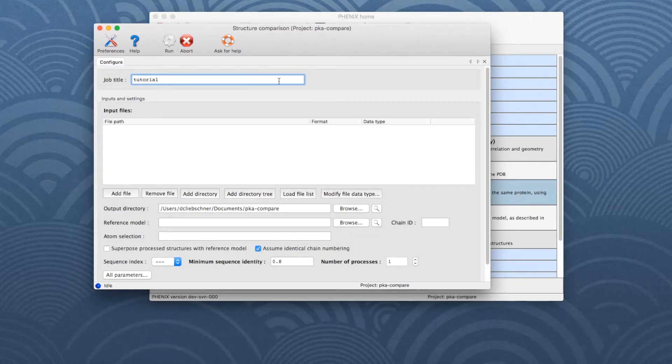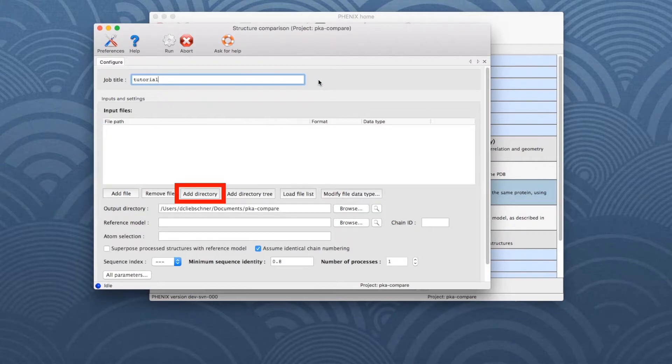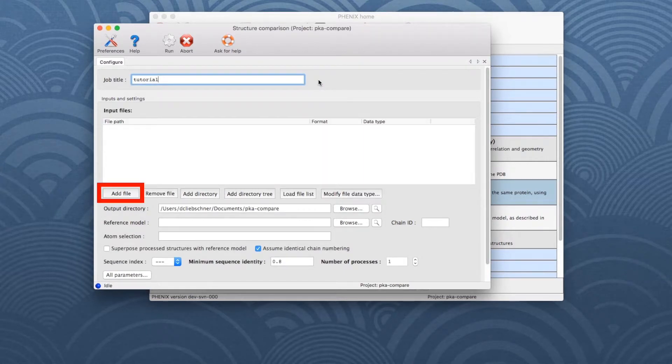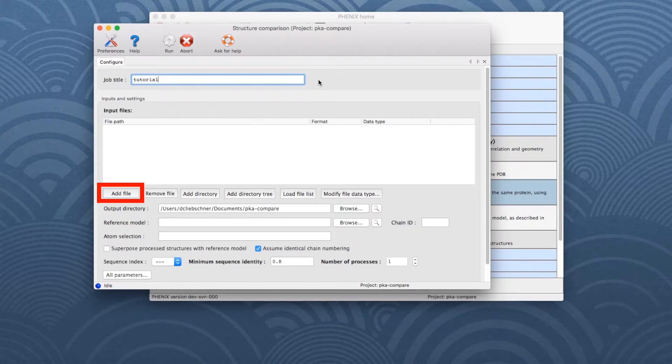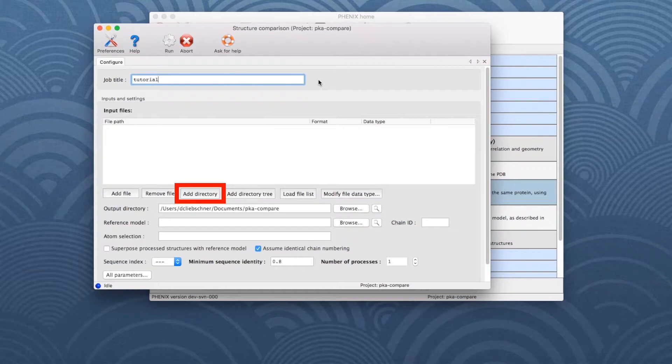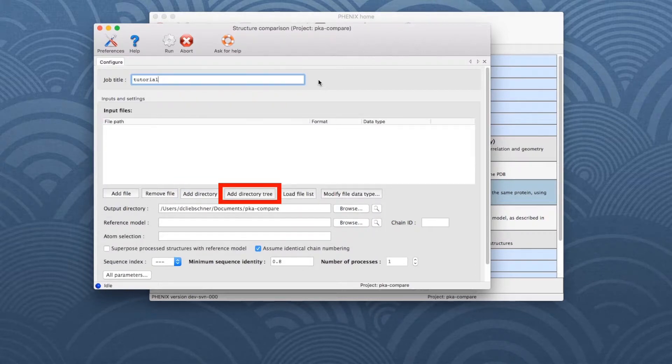To add files, either the Add File, Add Directory, or Add Directory Tree button can be used. Add File opens files one by one. Add Directory opens a pair of files, such as a model and a data file in a directory. And Add Directory Tree searches for file pairs by walking through a directory tree.